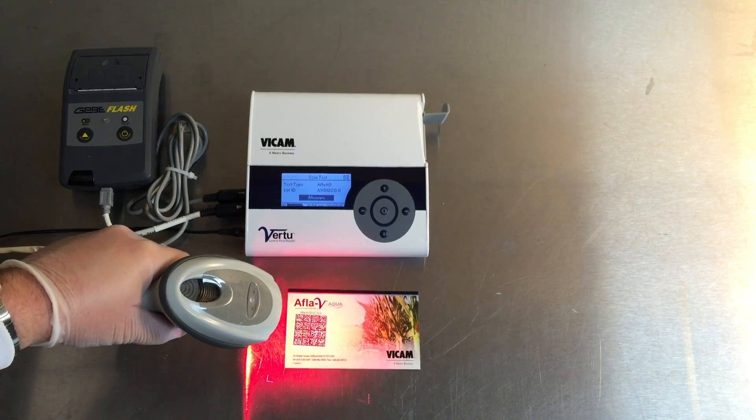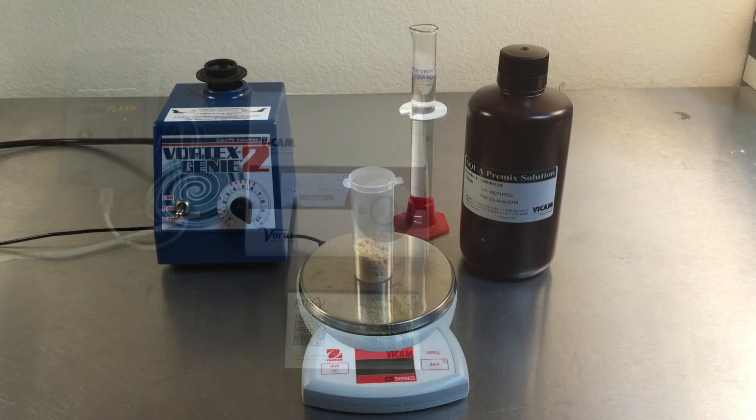Using the barcode scanner, scan the calibration card unique to every lot of Afla-V Aqua strips.